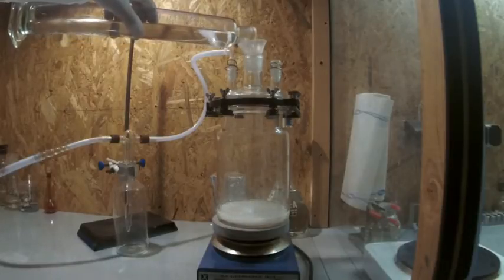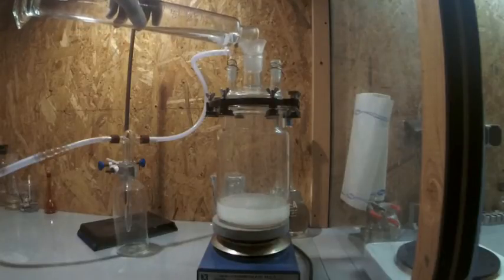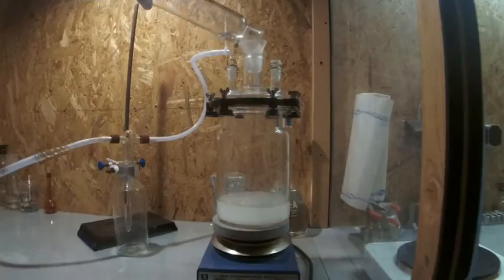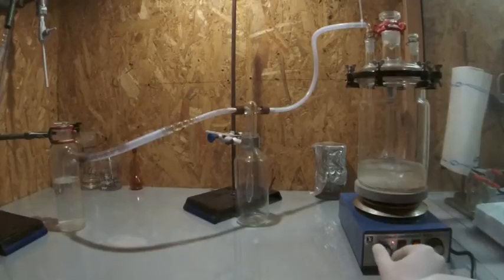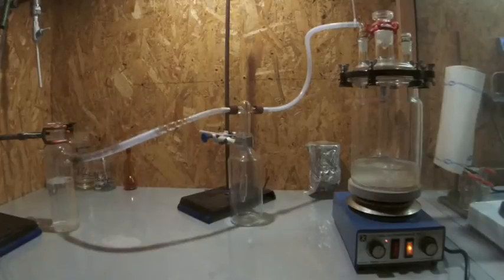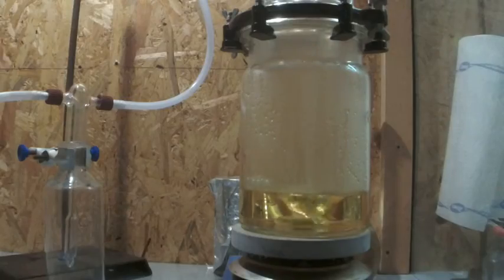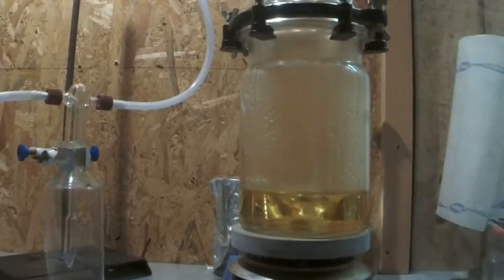It is unimportant whether you fill the nitric acid or the glucose first in the reaction vessel. To start the reaction, simply turn on the heating and set a constant stirring. You know that the reaction is starting when you see a color change. This is caused by nitrogen oxides which dissolve in the reaction mixture.